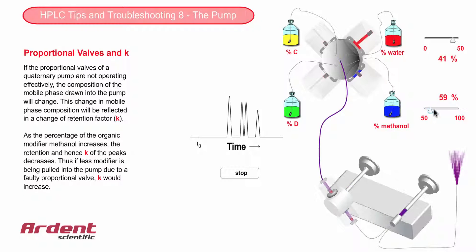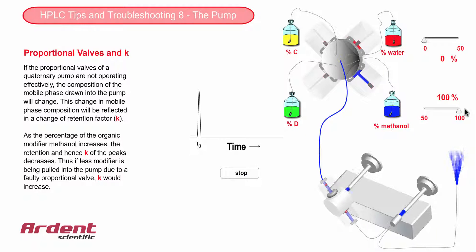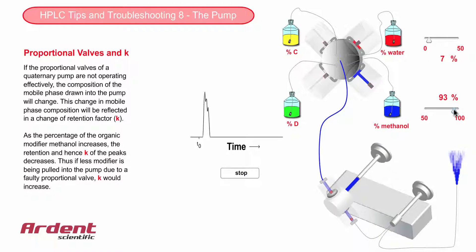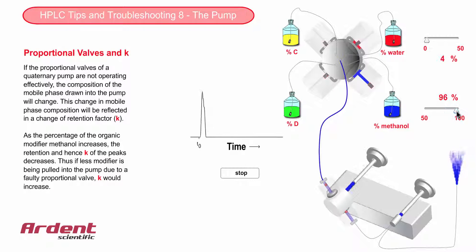If channel A, which contains the aqueous mobile phase, is leaking, this will result in relatively more organic modifier from channel B, and the retention factor will decrease as a result of this.